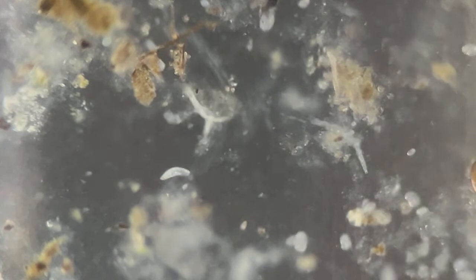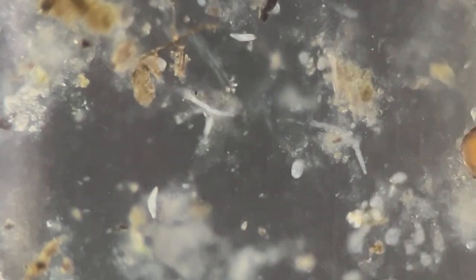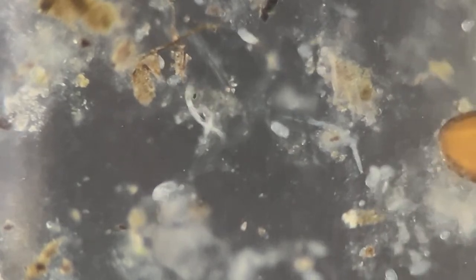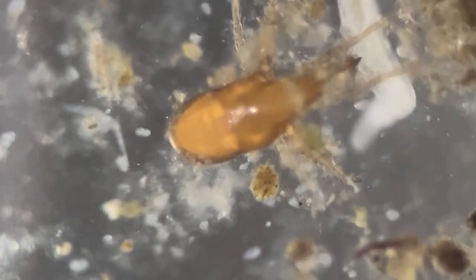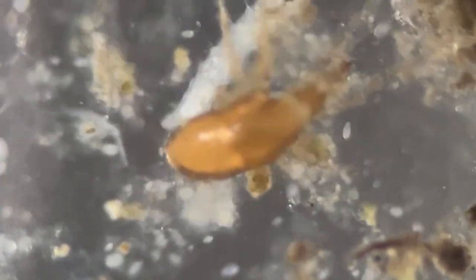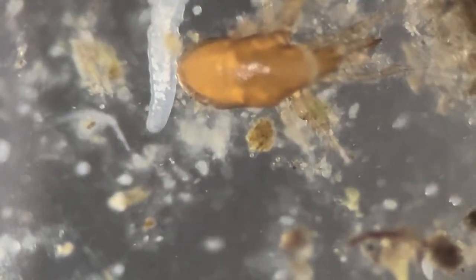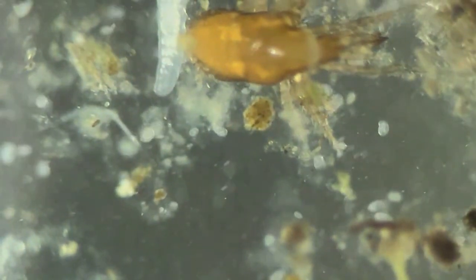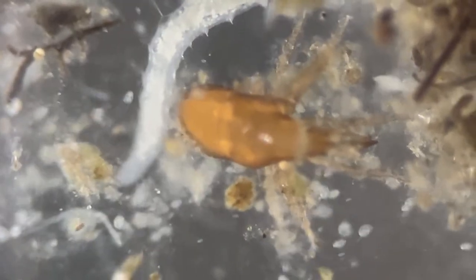What is happening is the other eyepiece, the adjacent eyepiece, being a binocular microscope, has been left uncovered, and since we are observing the reflective light, there is a two-way system. The light from the objective is being reflected to us, and the light from the eyepiece is being reflected to the objective. So what I see is this reflection. My movements are also reflected. So when I close it, the picture becomes much clearer. So I'll have to close it by some means or the other.